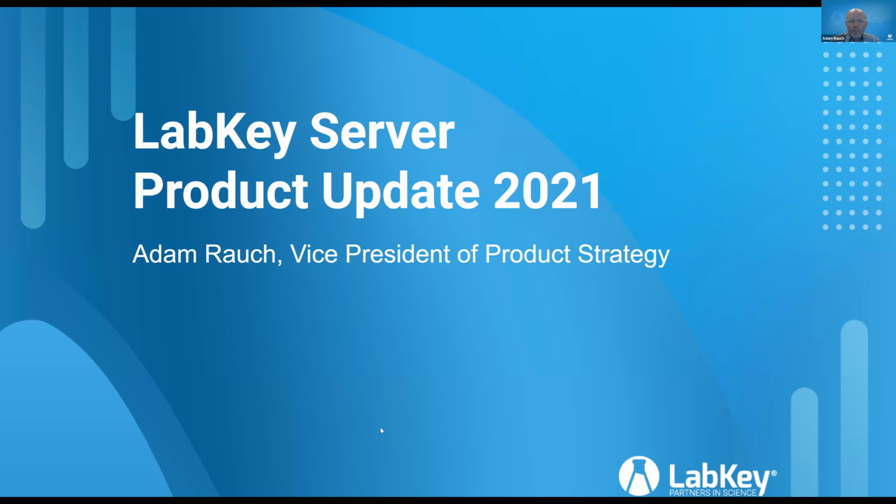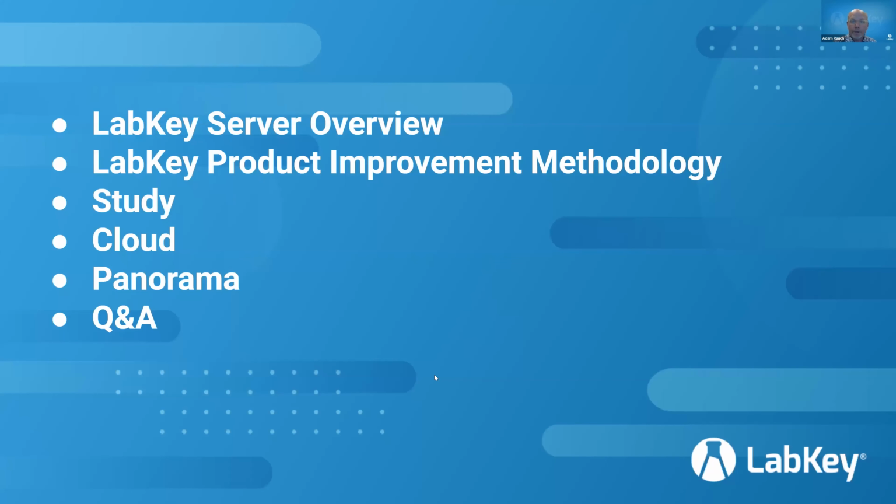I have learned through doing this for many years that it's pretty much impossible to cover everything we've done, or even summarize everything we've done with LabKey Server over a year, in just half an hour. So I'm going to focus on a couple of key areas, areas of emphasis for us over the last year. And hopefully that'll give you a sense for what we've been doing and give everyone some new ideas and new things that they didn't know about.